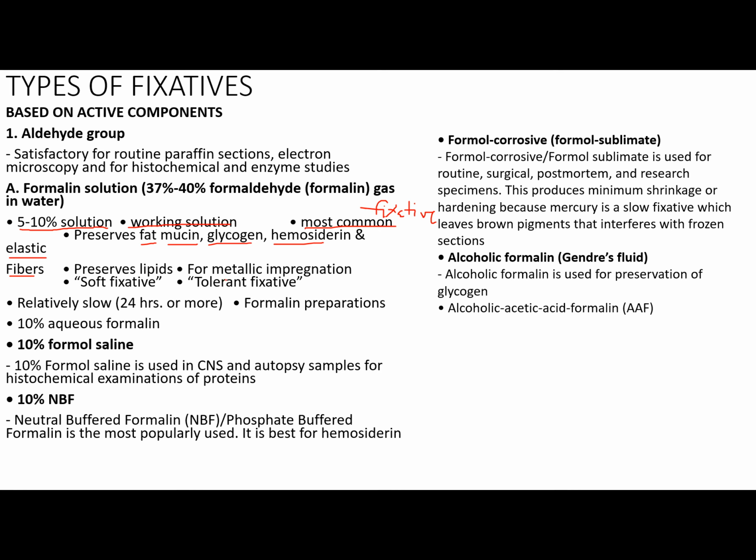It can also preserve lipids for metallic impregnation, soft fixative, tolerant fixative. Relatively slow, 24 hours or more are needed for fixation. So mabagal siya class, you need to fix the sample for at least 24 hours or more.